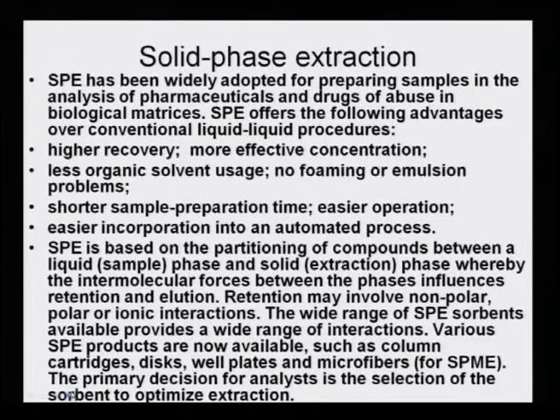It has high recovery, more effective concentration method, less organic solvent usage, no foaming, no emulsion problem, shorter sample preparation time, easier operation, easier incorporation into an automated process, and because of these advantages, it came into existence and it was used for the purpose of extraction.